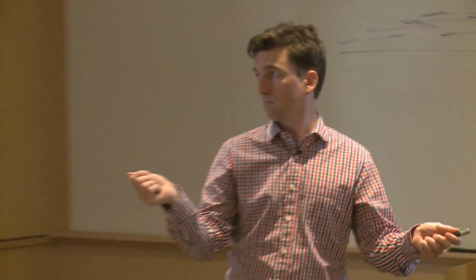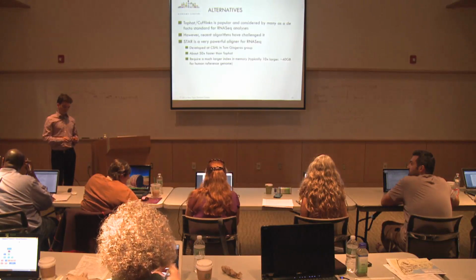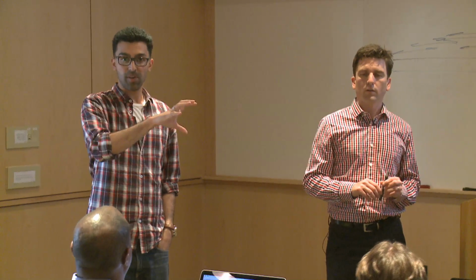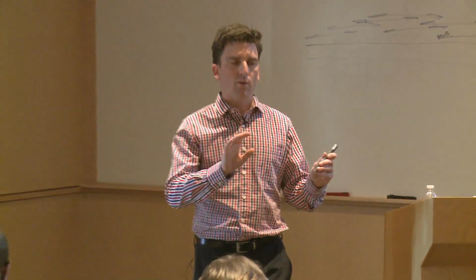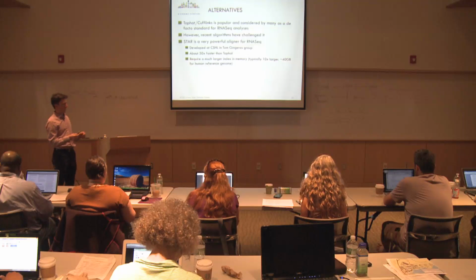So we actually do that for you in DNA Subway. When you choose what organism you're working with, along with loading in the reference FASTA and annotation, we pre-built the index from the FASTA. But for information, they don't have to pre-exist. You can do it as long as you have the FASTA file. Okay?